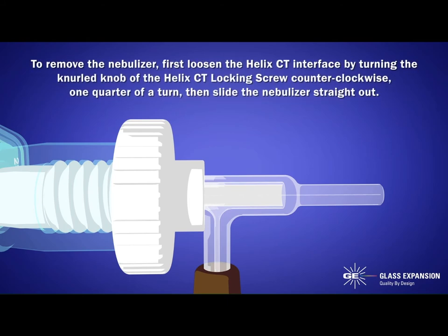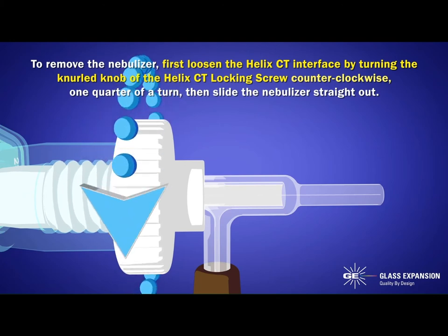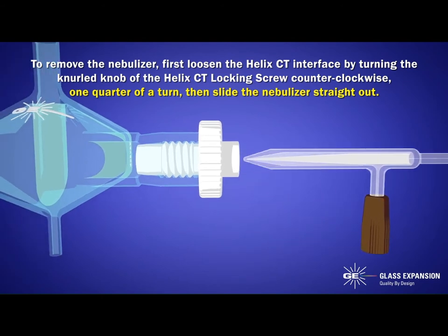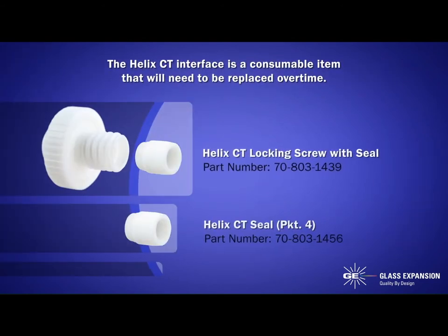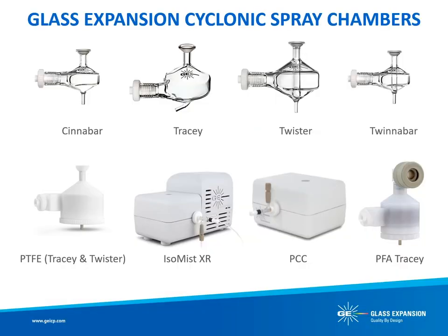To remove the nebulizer, first loosen the Helix CT interface by turning the knurled knob of the Helix CT locking screw counterclockwise one quarter of a turn, then slide the nebulizer straight out. The Helix CT interface is a consumable item that will need to be replaced over time. Now that we have detailed the unique features of Glass Expansion spray chambers, let's move on to the spray chamber selection guide.